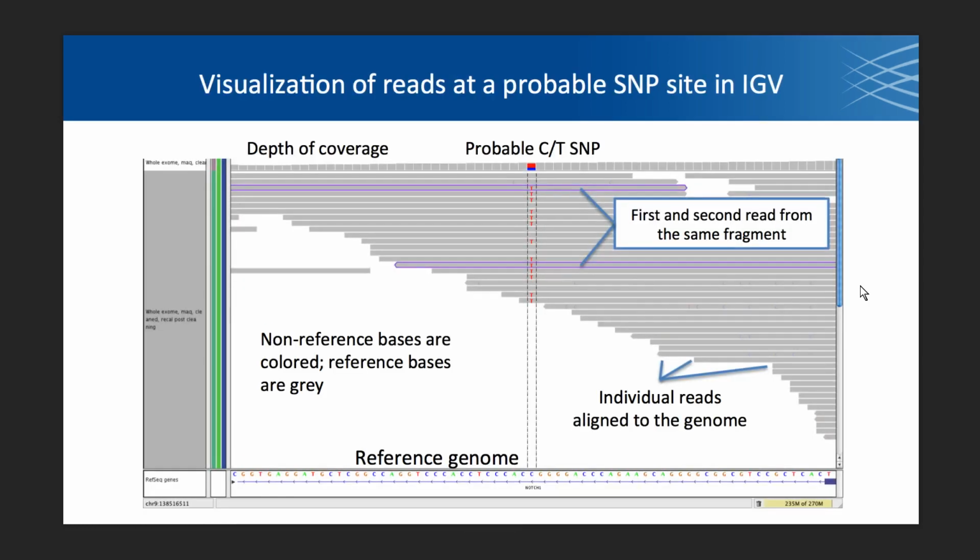So here we have a screenshot from IGV, which is the Integrative Genomics Viewer developed at the Broad, which is a beautiful way to visualize BAM data, specifically aligned BAM data, because we have the reference here along the bottom. There's a RefSeq track, which tells you that we are in an intron. You can tell because it has a skinny line, whereas the gene itself will have a thicker line like this. And then the little arrows show the reading frame direction, and then we're giving the gene name here, which is NOTCH1. So all of these gray bars represent different reads.